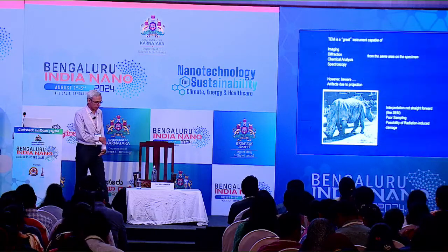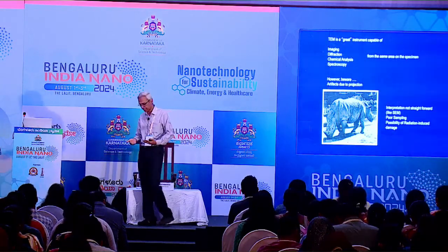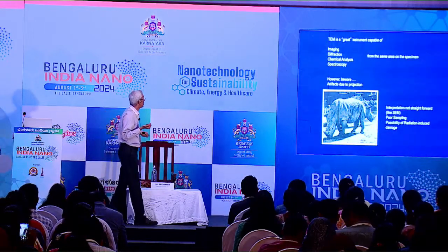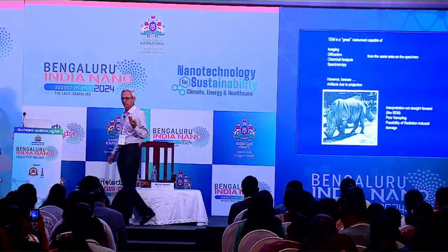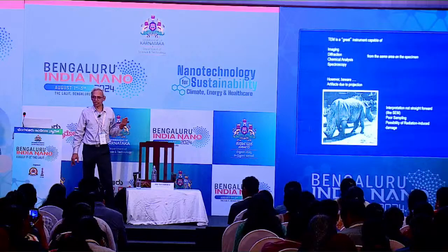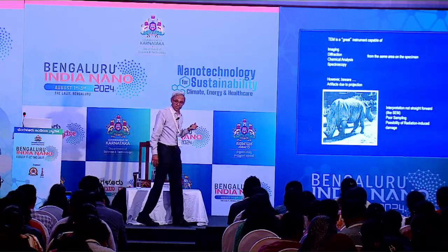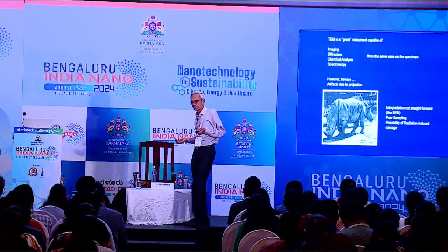I told you it's multiple techniques, right? It can do what's called imaging, which is obviously straightforward, that we can look at things at a much higher resolution. So that is the first thing that a TEM is expected to do. It can do diffraction. I'm sure most of you have heard of X-ray diffraction, Bragg's law, things like that, right? We can actually use electron waves to get diffraction from materials.